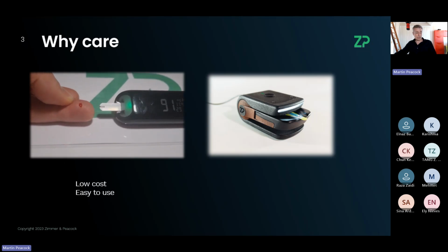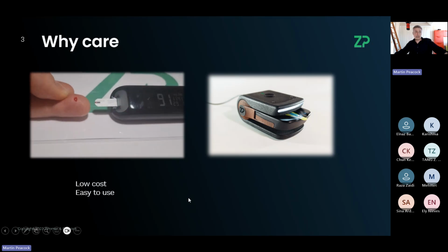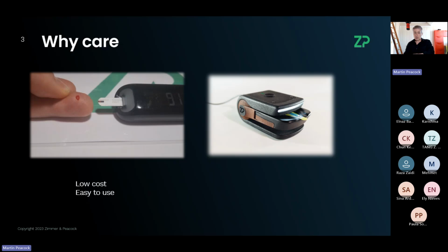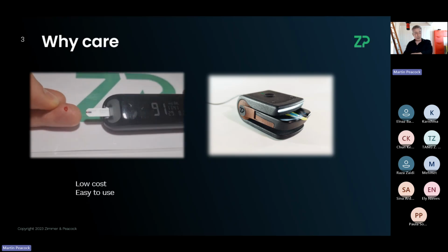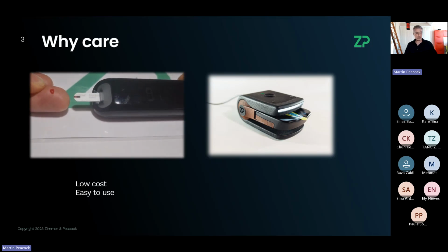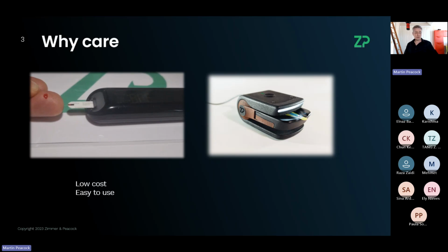What does that short demonstration, where I just measured my blood glucose, show you? It shows you it's easy to use. And I do want to illustrate that if you're developing assays using screen-printed electrodes, they should be easy to use. Sometimes when you read scientific papers, people are often normalizing data, or using some sort of strange calibration. They're doing that because there's a problem with reproducibility in screen-printed electrodes. But now some of you are users of our electrodes, so you can call me out on this. I do try to support you and explain where your irreproducibility might be coming from. But I will demonstrate a real world example, and I will get a really good result because of the reproducibility of the electrodes.